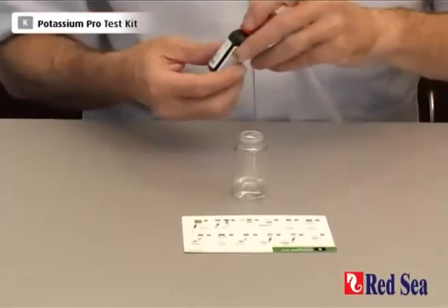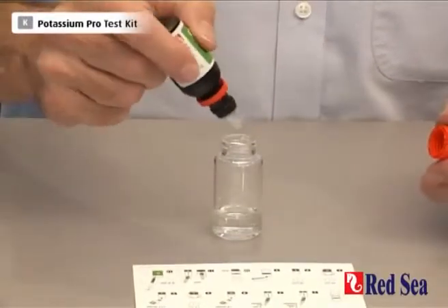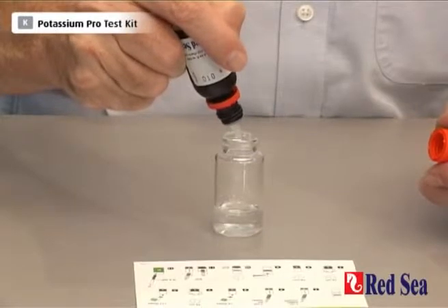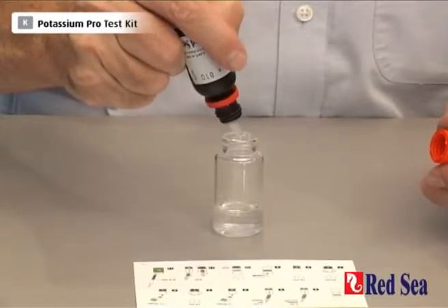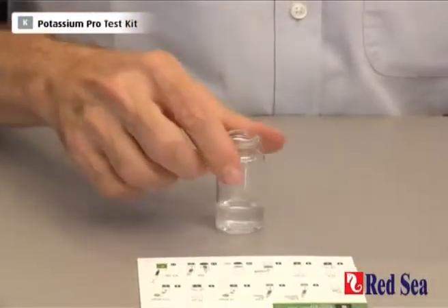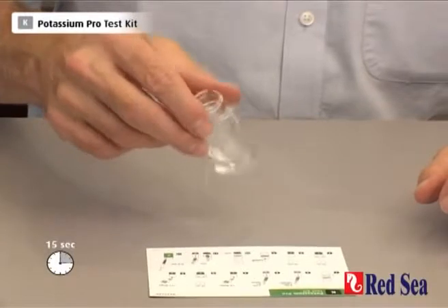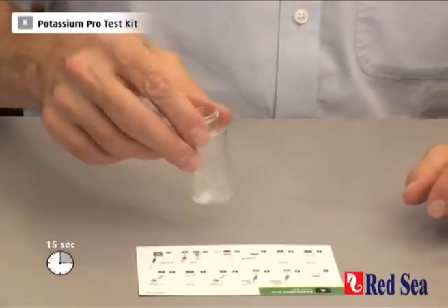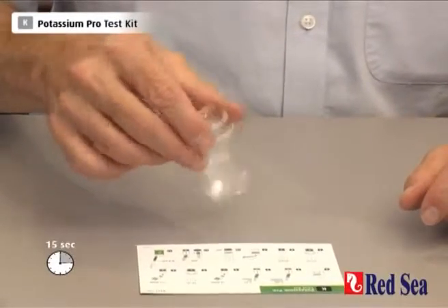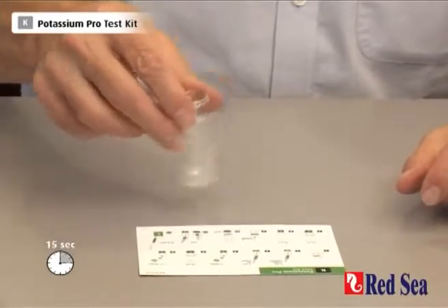We now start by adding 4 drops of reagent A — 1, 2, 3, 4. Shake for 15 seconds.